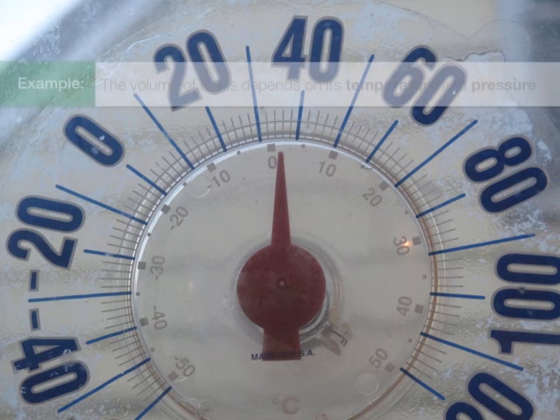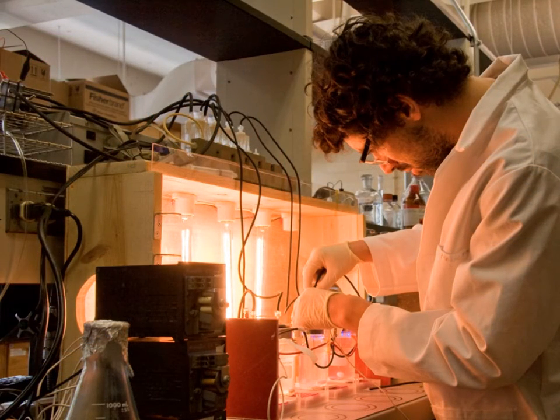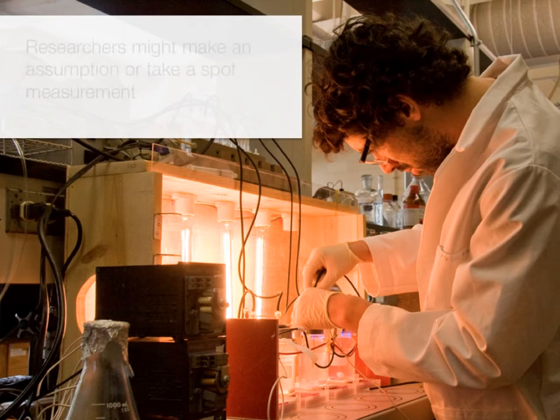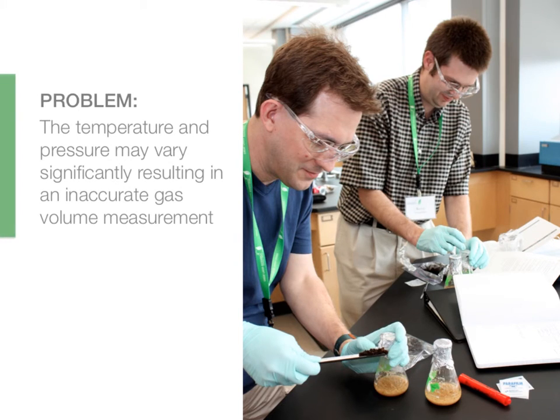Let's take a look at a specific example. The volume of a gas depends on its temperature and pressure. When studying gas volume, it is vital to consider and accurately report both of these parameters. Still, researchers today might simply assume a pressure or temperature measurement. Alternatively, they might just take a spot measurement. The problem with this approach is that over the course of time, the temperature and pressure may vary significantly, resulting in an inaccurate gas volume measurement.